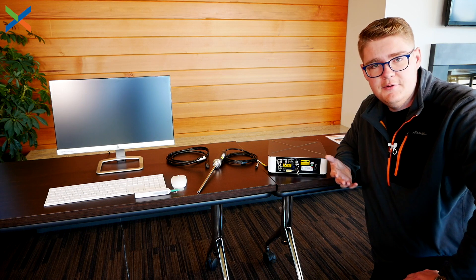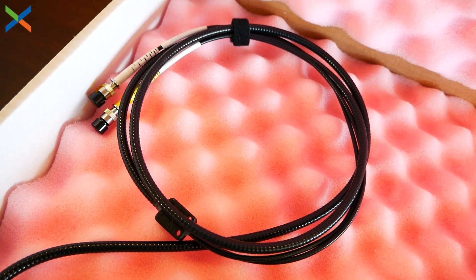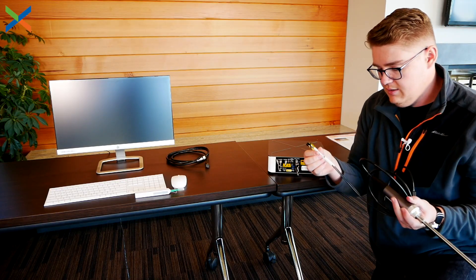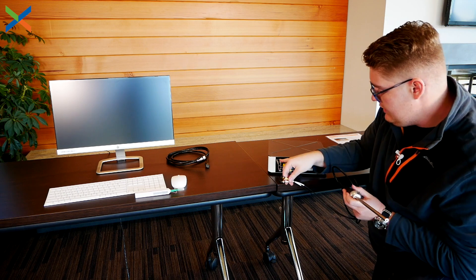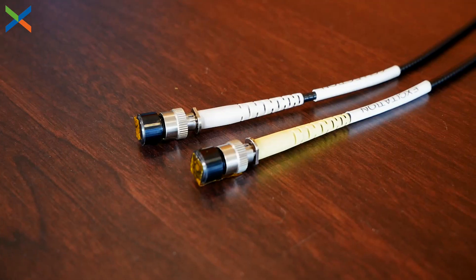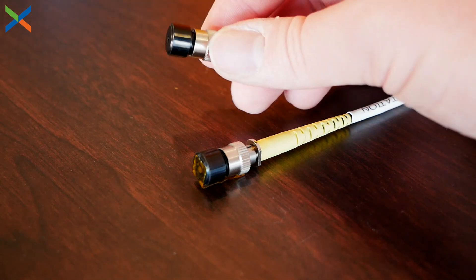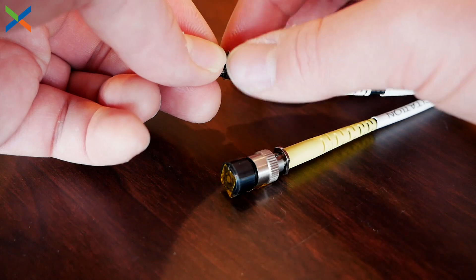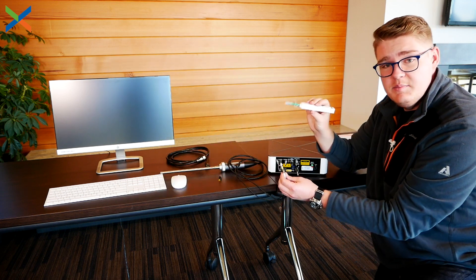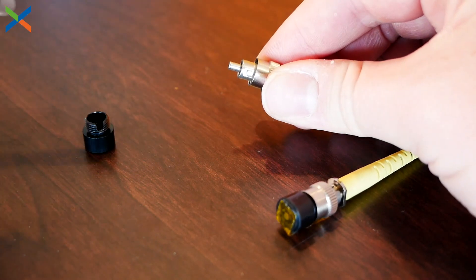Setting up the ball probe is probably the most technical part of the initial setup process. You want to be really careful here because we're dealing with fiber optic cables — they're super sensitive and we don't want to damage them. Take the ball probe and you'll see two plugs on the end, one labeled collection and one labeled excitation. Before plugging in, we're going to use this cleaning pen to clean the end of the fiber optic cable. Carefully place it on top, click it once, click it twice, and it should be clean.